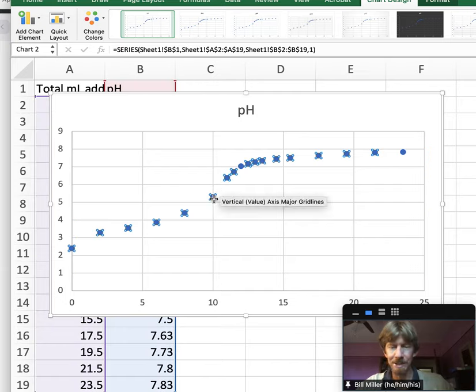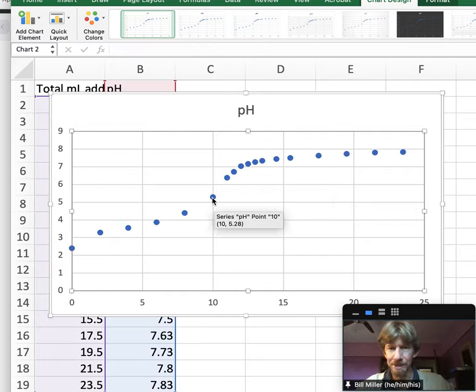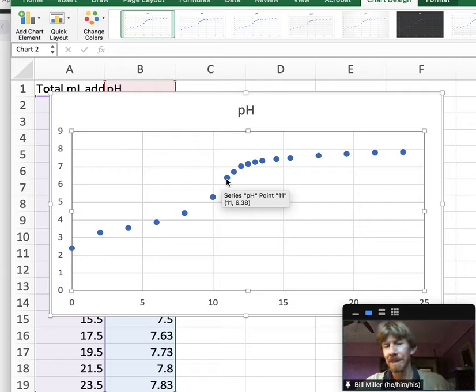So I'm going to take this point, which is 10, and this point, which is 11. I'm going to guess that my equivalence point is 10.5 milliliters because this is the steepest part.